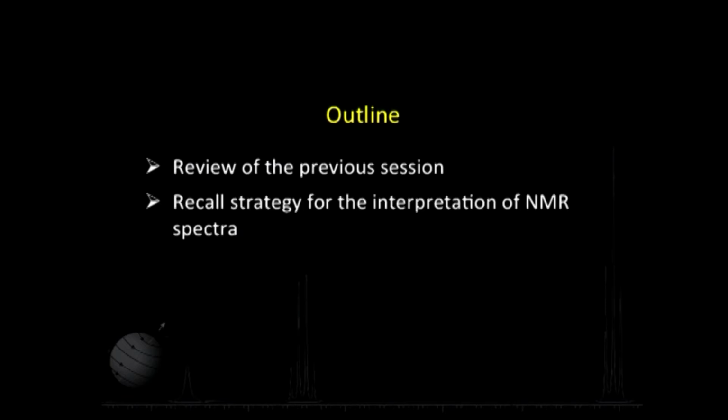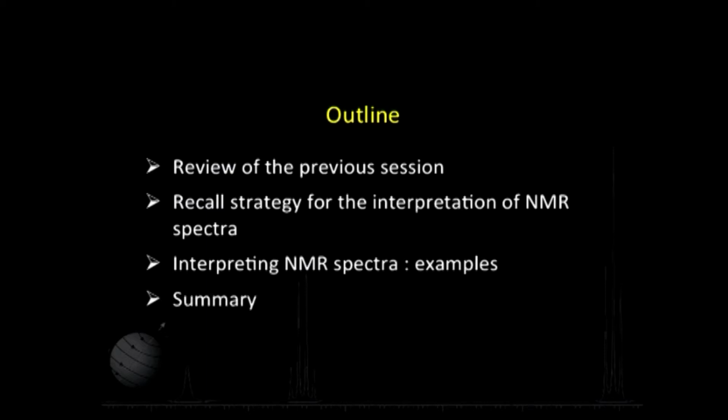The session is planned as follows. To begin with, we will briefly review what we did in the previous session. Thereafter we will recall the strategy for the interpretation of NMR spectra which we evolved in the previous session, and then we will take up certain examples of different NMR spectra and try to interpret them in terms of the structure of the molecules. Towards the end we will sum up what we do today.